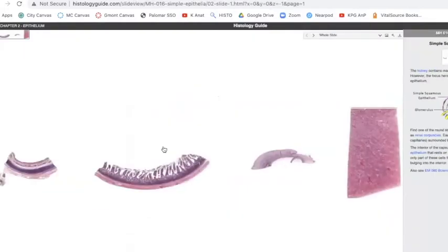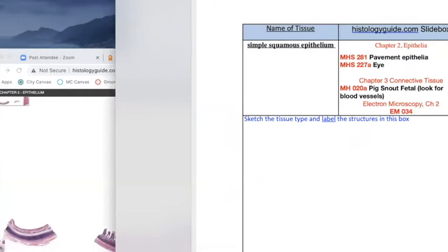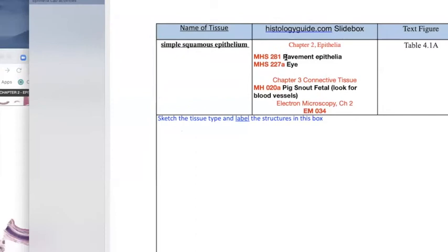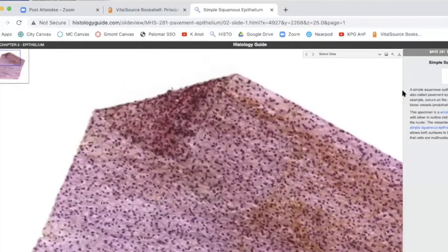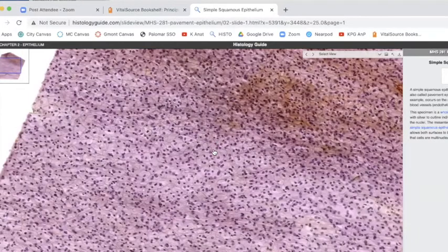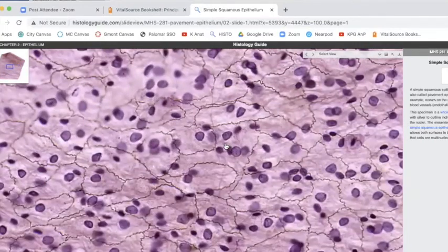So for instance, here is your lab activity. This is the epithelial one, where I give you a couple of samples of different types of epithelium. And we're going to go down to this sample. This looks a lot like, in fact, this is the same kind of sample, from that mesentery. Again, you don't have to know it, but this is the coating of that loose connective tissue that you saw.